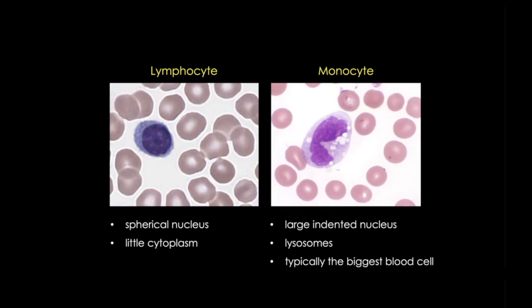I hope you can now appreciate the spherical, darkly basophilic nucleus and scant cytoplasm of the lymphocyte, and the large, indented nucleus and pale cytoplasm with lysosomes of the monocyte. I hope these tips will help you solve this case of mistaken identity. Thanks for stopping by.